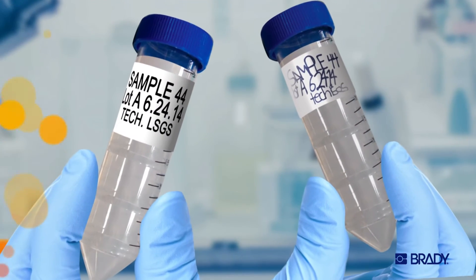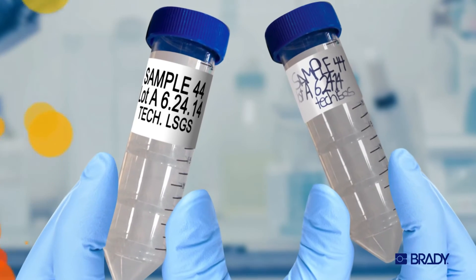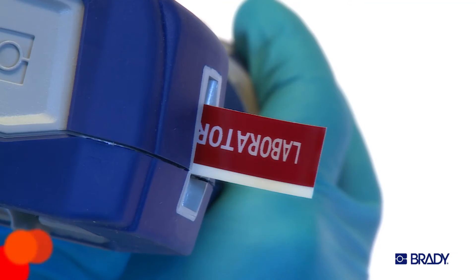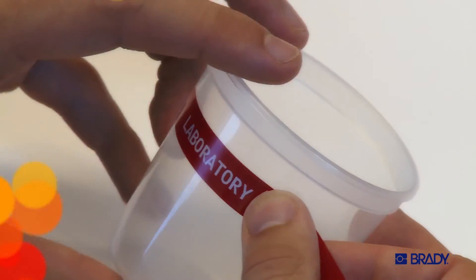Illegible, smeared, missing labels — that's not how a lab should function. Trust me, I've been there. So don't get stuck. Get legible labels that stick.